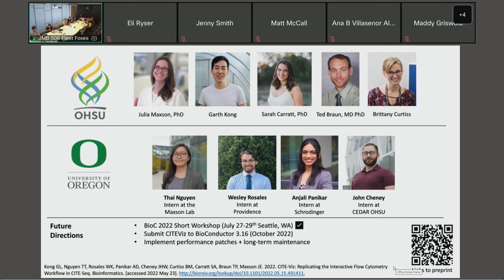So there's a question from online. I was wondering if you could save the code too for replicating the same gates with a new data set, for reproducibility. So I think you have a lot of the information stored in that gate object. Mm-hmm. But I think the question is about the actual code, so that you can put it in a pipeline and make it more reproducible for a figure of a paper or something. Mm-hmm.